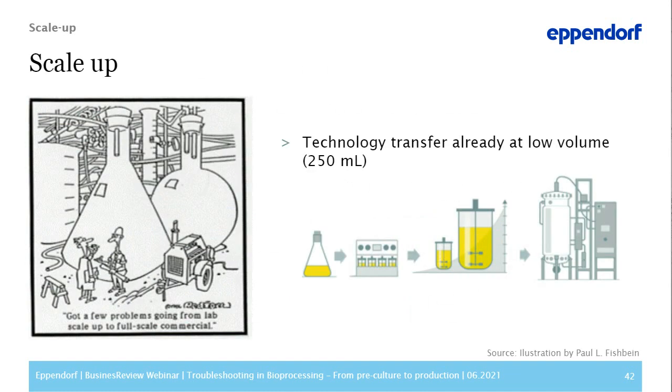And then lastly, the idea and the goal of a successful scale-up strategy is to think about scale-up right from the small-scale R&D cultures. Once you have scale-up considerations in mind right at the small scale, it becomes relatively easy and a smooth process to move from a small to a large scale. So always keep it in mind right from the beginning.